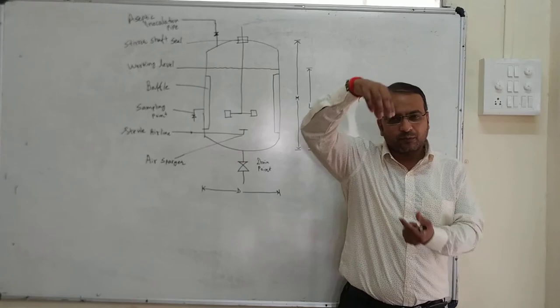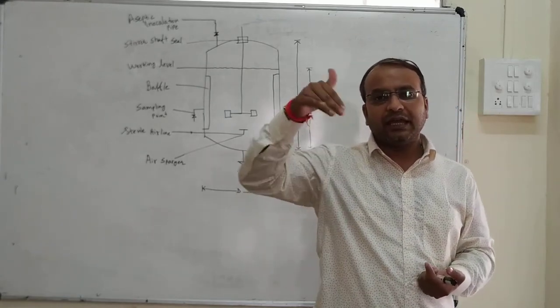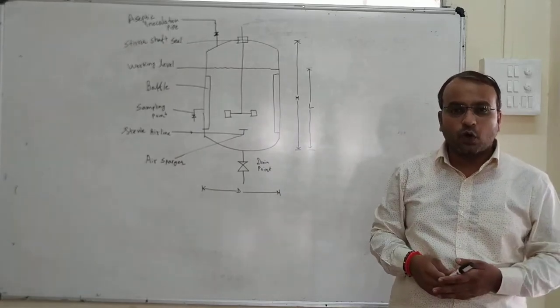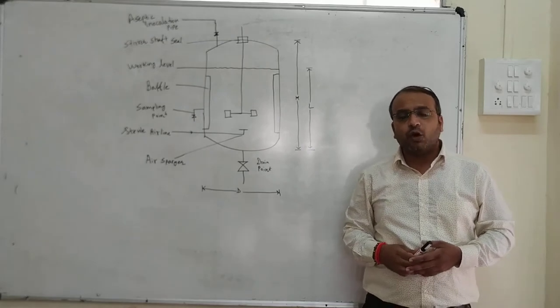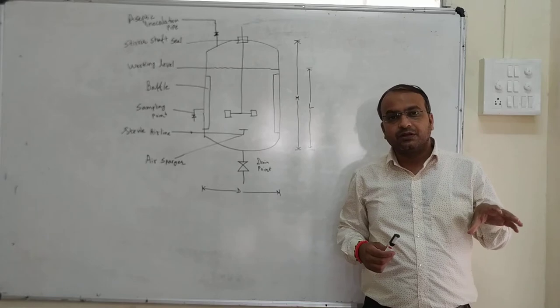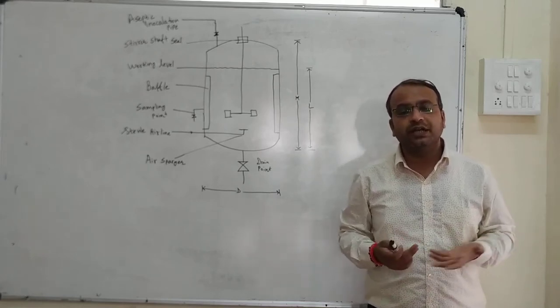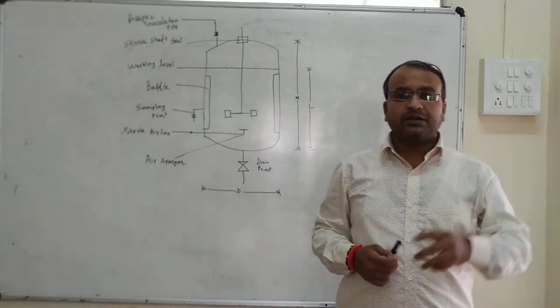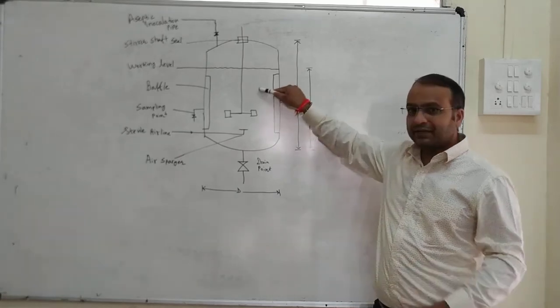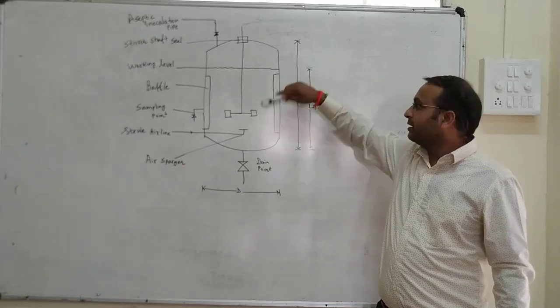If you remember, we put a cotton plug, and whenever we mix it, more and more air enters the flask. As there is a cotton plug, that air is filtered air, and the oxygen is supplied to the culture. In this way, more pronounced growth can be observed in a flask kept in a shaking incubator. Similarly at the reactor level, we have made a provision of a stirrer.